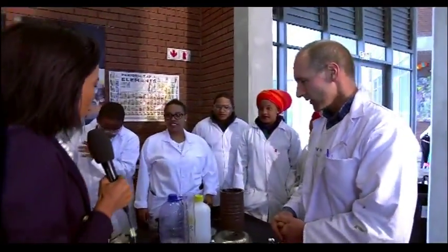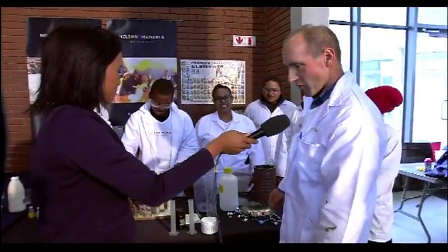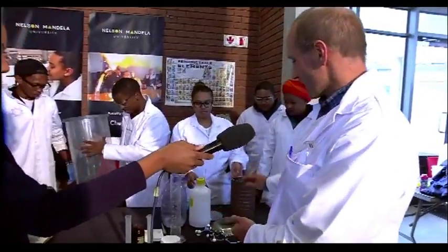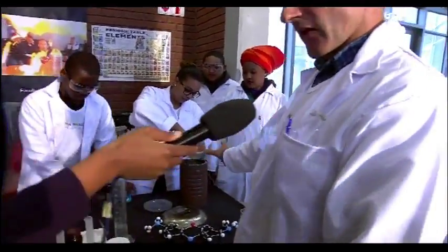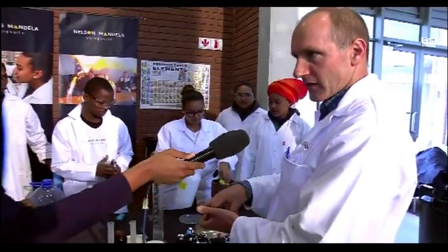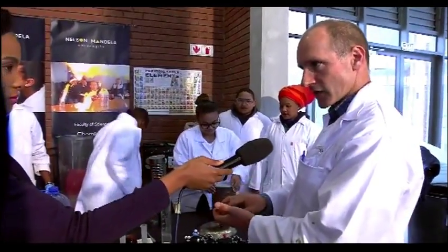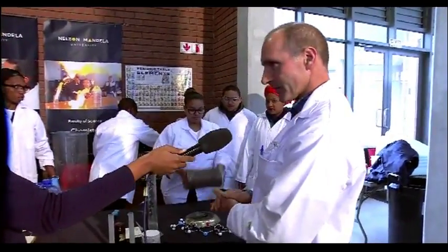Okay, the last one that we have right now, early on there was an explosion, so I'm going to step aside a bit and ask you to tell us briefly what this one's about. What we have here is an old coffee tin, something that is readily available. We're going to make use of some methanol, which we saw burning earlier as a fuel. What we try to simulate in this reaction is the equivalent of what's happening in your car engine. In your car engine, you've got fuel being injected in, mixing with air, and then a spark comes along to perform the ignition. The explosion inside the engine, the power driven and the volume change, will actually turn the engine. Let's see if they can do a similar reaction here now.